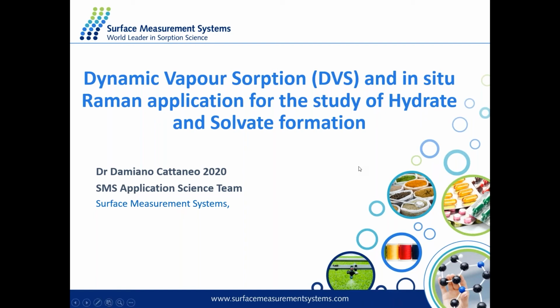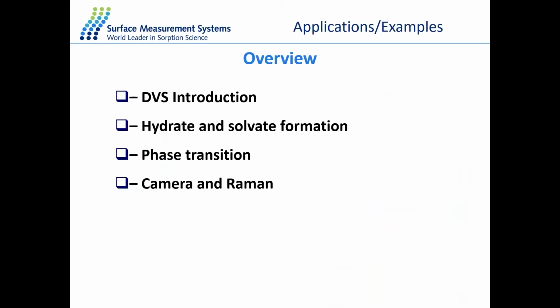Okay, so in today's presentation, I'm going to go over a quick introduction related to the technology that we are using and describe it today, so DVS. Then we are going to do an overview of an analysis process of hydrate and solvate formation in DVS, from a point of view of gravimetric technique.